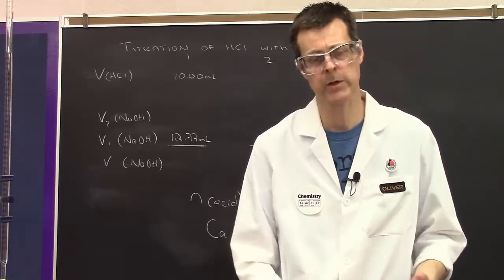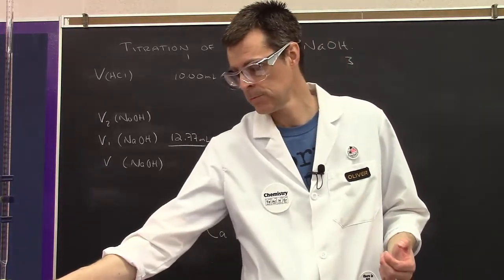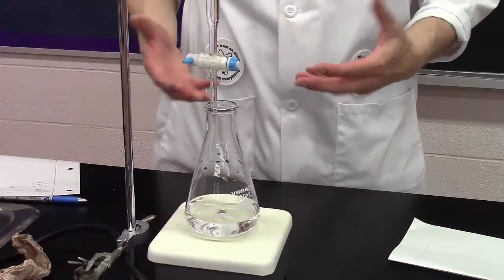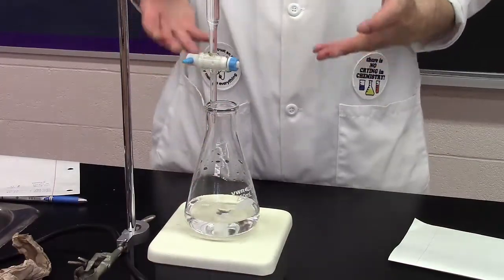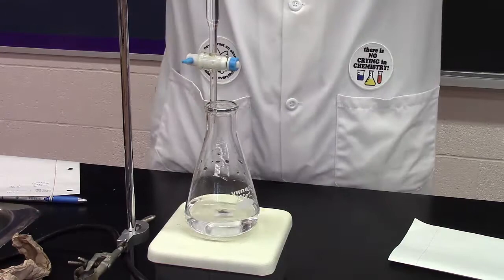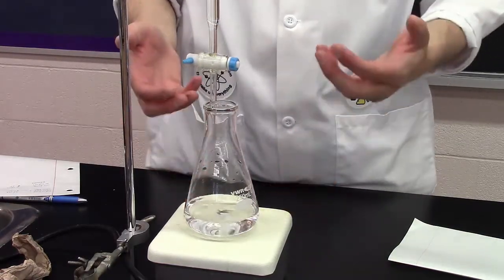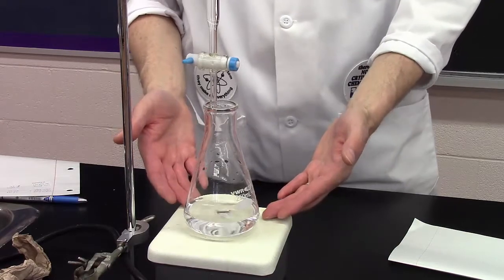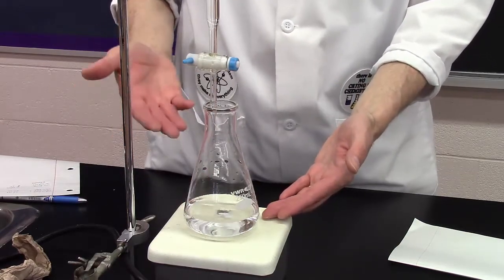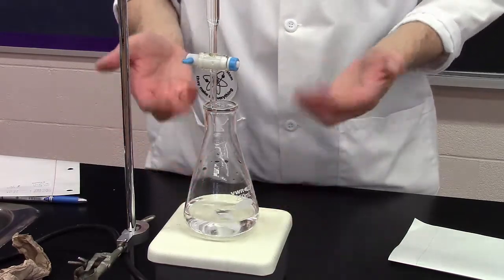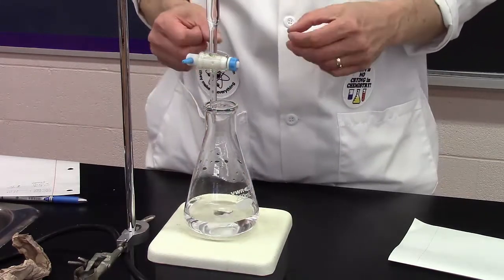At that point, I'm going to do the titration. As I said earlier, the basic setup is exactly the same as the previous one - I have an acid in the flask, phenolphthalein indicator that will turn pink as the pH goes from acidic to slightly basic. I'm aiming for a faint pink.